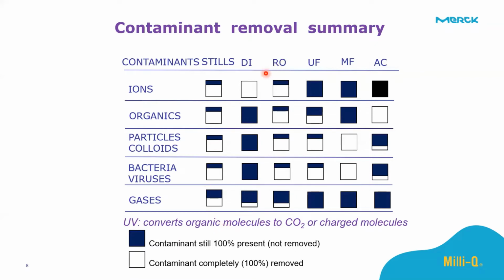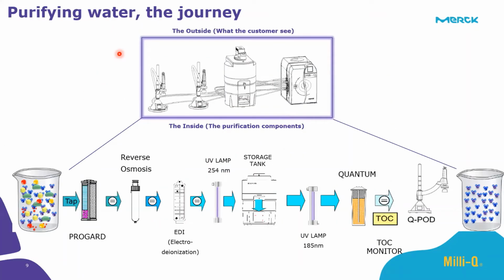But most water purification system manufacturing companies normally use reverse osmosis as one of their purification technologies in the system. But also something I would like to note is that none of them can remove everything alone. So a water purification system needs to combine these purification techniques to be able to remove all the contaminants. And that brings me to what you normally see in our water system.